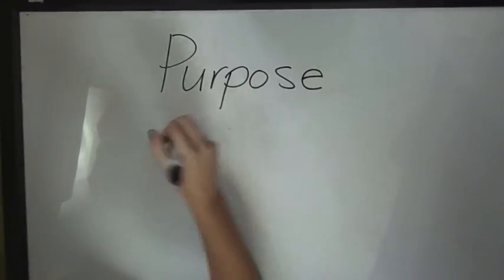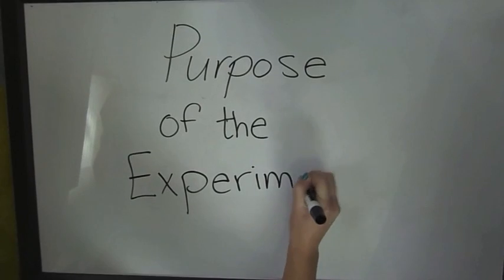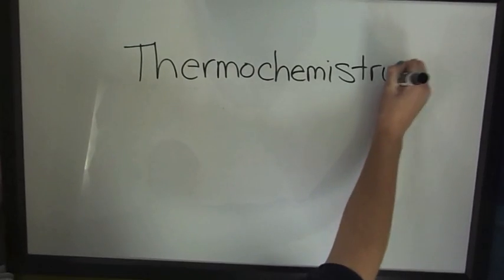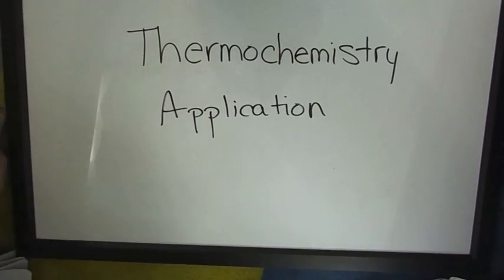The purpose of this experiment is to apply Hess's law to a practical scenario and to utilize learned thermochemistry applications in order to draw conclusions. This process is an example of an application of thermochemistry, such as one that might be used by chemists to draw practical conclusions about processes such as their heat of reaction. This experiment utilizes many thermochemical equations and science skills.